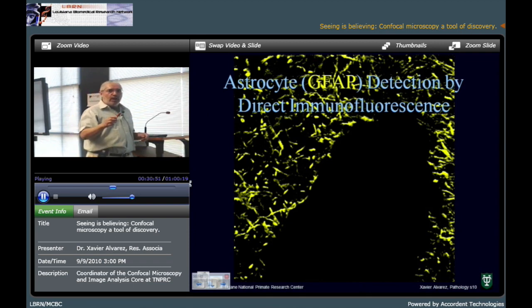We could use an antibody that has a label already. Most of the time it's the most expensive way of doing this. But if we have many colors to put on and we don't have one that will do the job, that's okay. And if we have the money, we could use this a lot. Every time I discuss with a principal investigator, we finish with this: it's more expensive not to have results than the antibody. There are always ways of finding the money to buy these things.